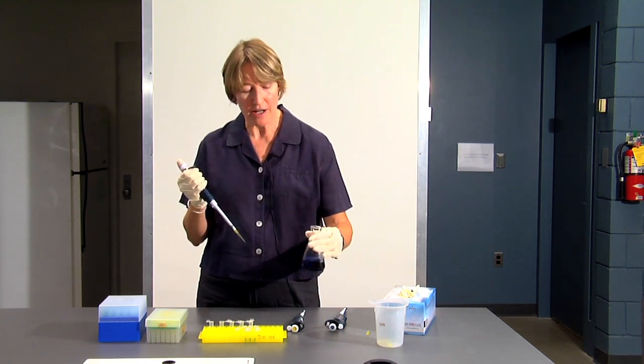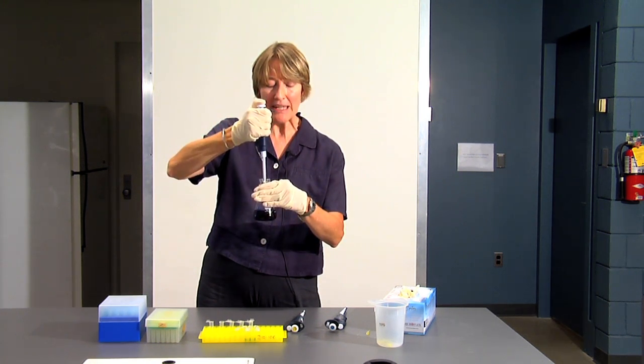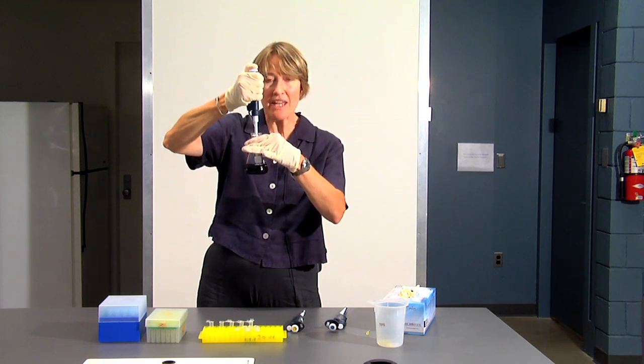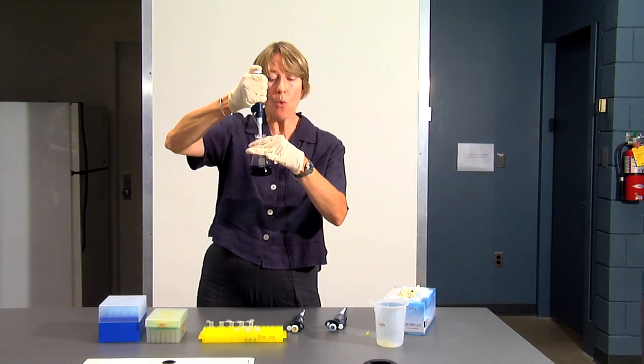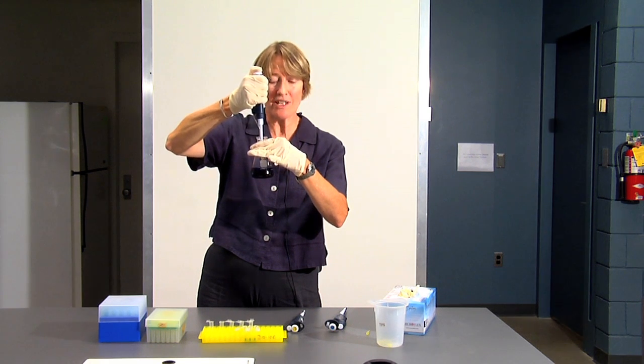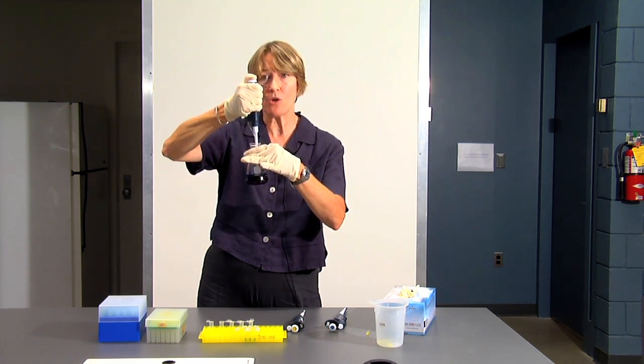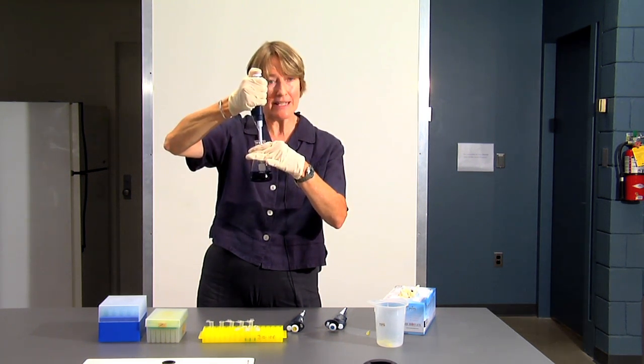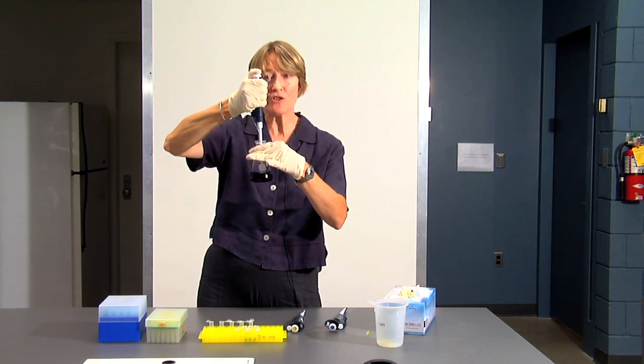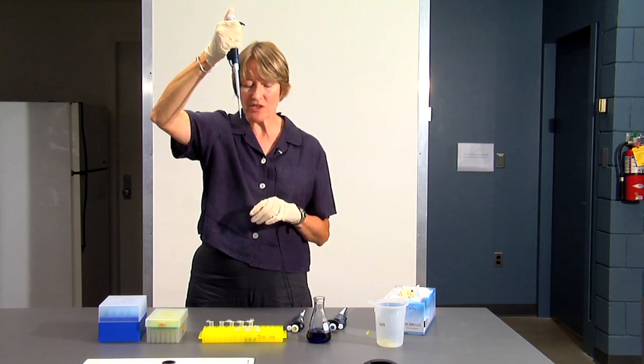So we're going to take some of our sample. You're going to depress the plunger to the first stop, put the pipette tip into the fluid, and you want to make sure that your tip is below the surface of the fluid, well below the surface of the fluid. You don't want to get the pipetter itself wet. You don't want it to go in too deep, but you want it to go in deep enough so that when you pull up the liquid into the tip you're not sucking up air. You don't want to get bubbles in the tip. So I pushed it down the plunger to the first stop. My pipette tip is under the surface of the fluid. I'm now going to slowly release the plunger and pull my sample up into my pipette tip. I now have 100 microliters of accurately measured sample in my pipette tip.